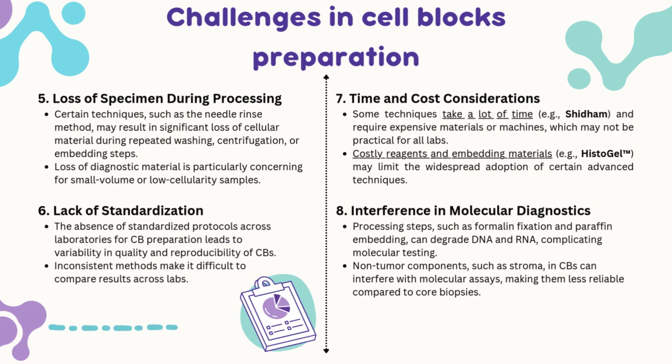Finally, molecular diagnostics can be impacted. Formalin fixation and paraffin embedding may degrade DNA and RNA, while non-tumor components like stroma in cell blocks can interfere with molecular assays, making them less reliable compared to core biopsies.